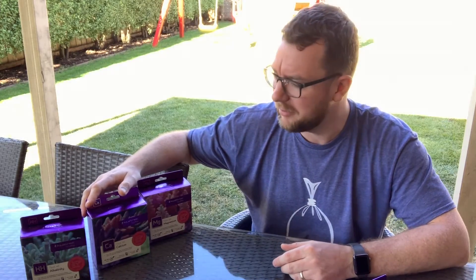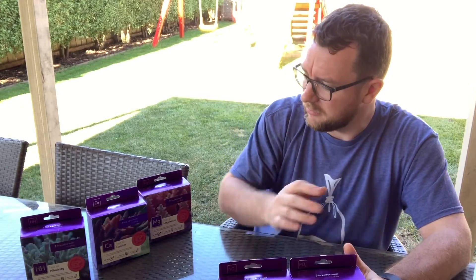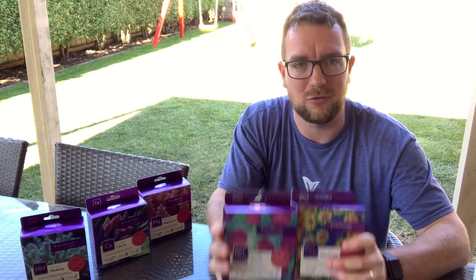Fun fact: I'm colorblind, so sometimes these titration test kits are a little bit tricky for me — we'll see how that pans out today. These new ones are the newest additions to the lineup, and obviously nitrate and phosphate are a little bit more complex in their testing mechanisms. I'm going to assume these three were easier to formulate, and that's why these two have come along afterwards.